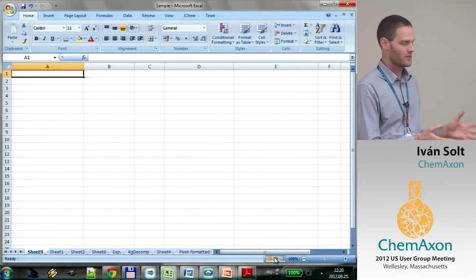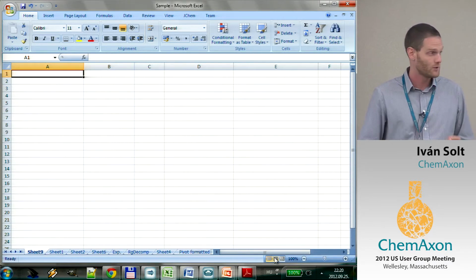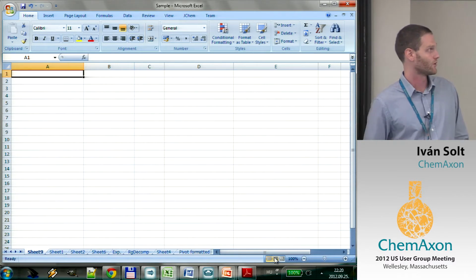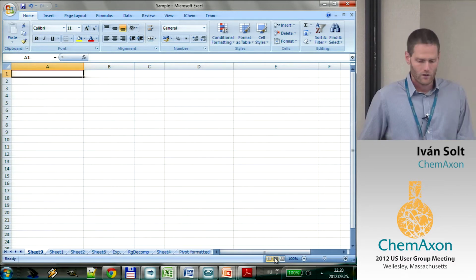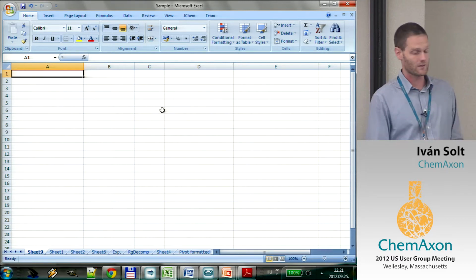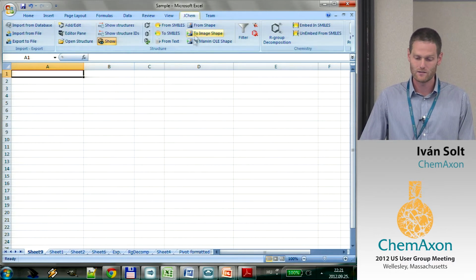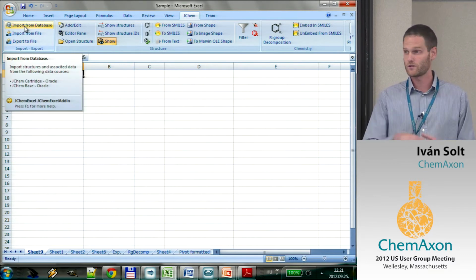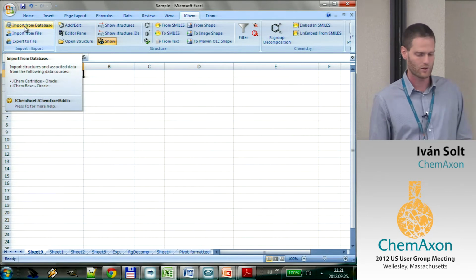still, this is a very straightforward tool, and it's very easy to use. And then I recognized that actually this is why we should be talking about this, because this is really simple. So it can be a very simple solution for many problems, and I think we should point this out. Okay, so once you install JChem for Excel, you will get the integration of the ChemAxon technology into Microsoft Excel's environment. What you will get is an extra tab, a JChem tab, that offers you a collection of buttons through which you can access chemical functionality within Excel spreadsheets.